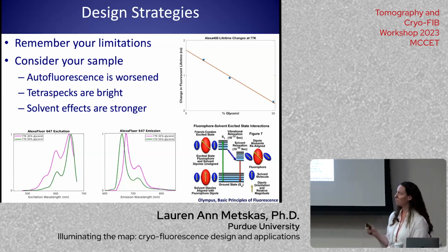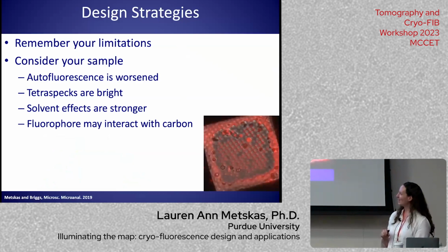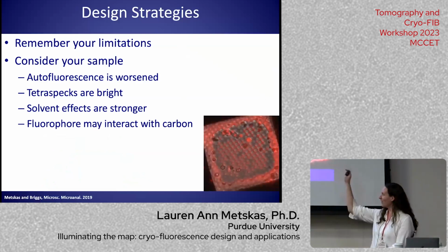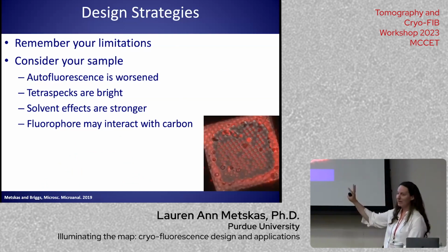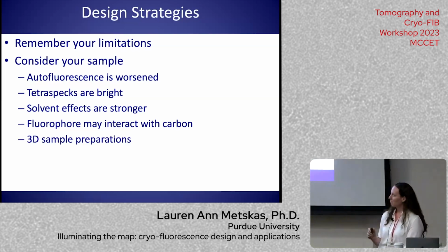a chemical level. All right, and finally, well, not finally, the fluorophore can interact with your carbon. This is one beautiful example that's awful, which is why I like to show it. I had a membrane dye, actually. It should have been this beautiful punctate on this grid, but it actually came out of the membrane and onto the carbon. Your fluorophores may really love the carbon, so this is something you want to screen for.